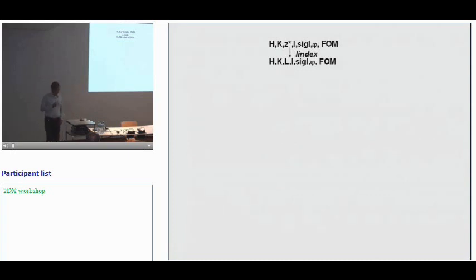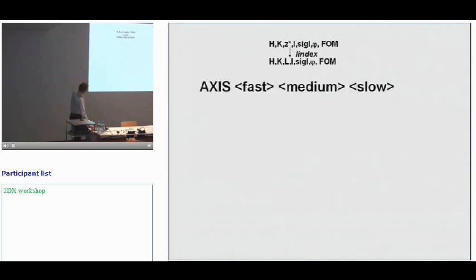The next step then is to transform this Z-star to an L index. This is a simple operation, and we do this by a simple Python script. But at this stage, one can start to consider later steps. We are going to calculate a map eventually, and a map in 3D has 3 directions, X, Y, Z. And these can be defined.